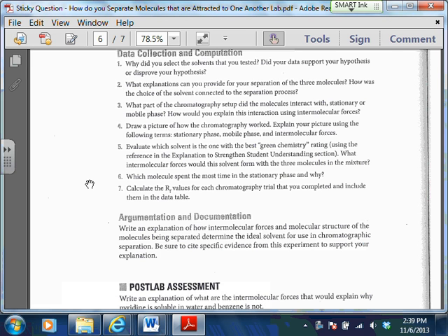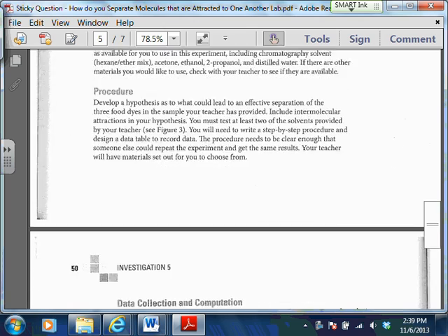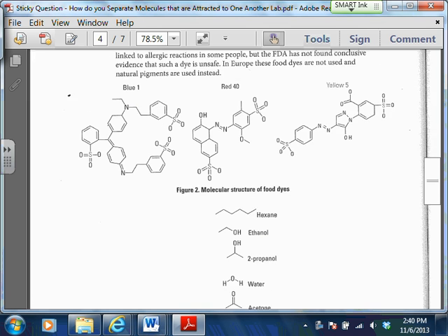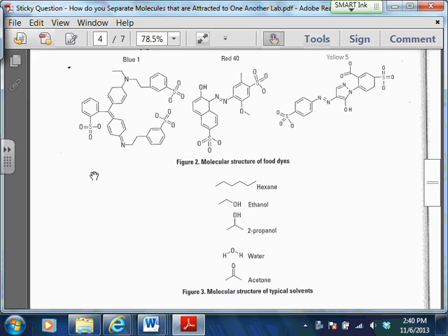Okay. So what I think you're probably going to see here, this is my guess, and it's based on what I thought I was seeing today, is that the water was the best solvent. I think that's the one that provided the best separation out of all of them.